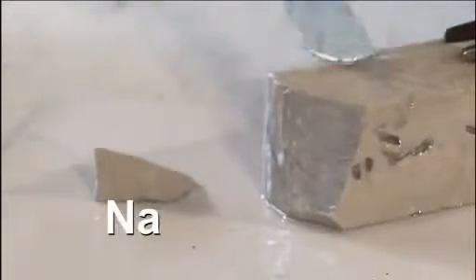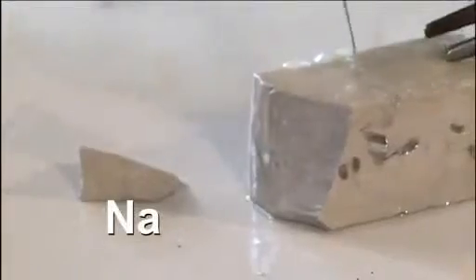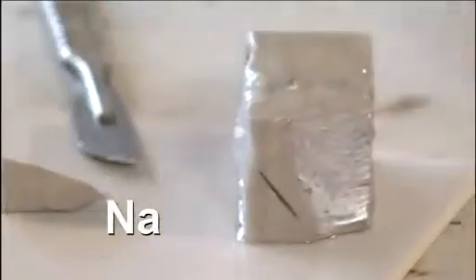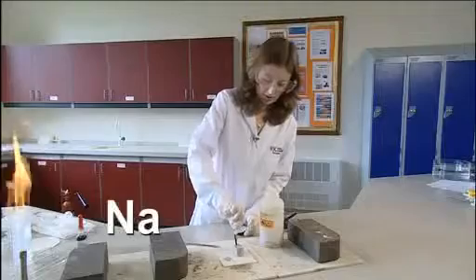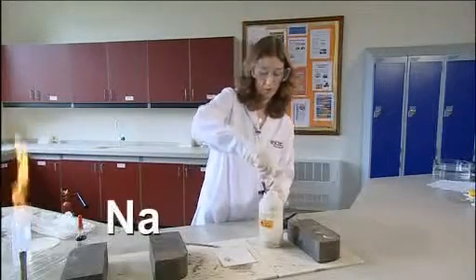And you can see the lovely shiny silver surface that tarnishes much quicker than the lithium in air. Put that large chunk back in the oil.